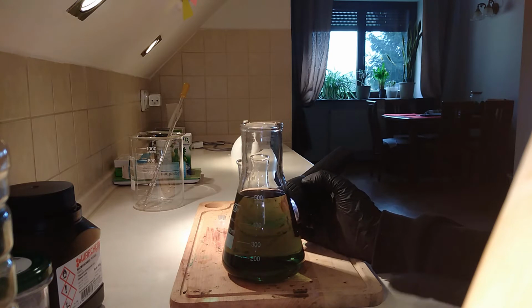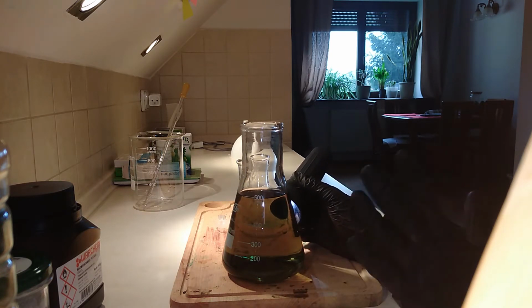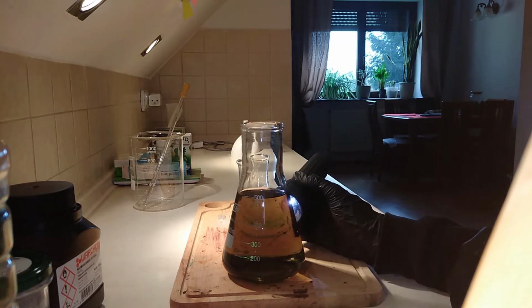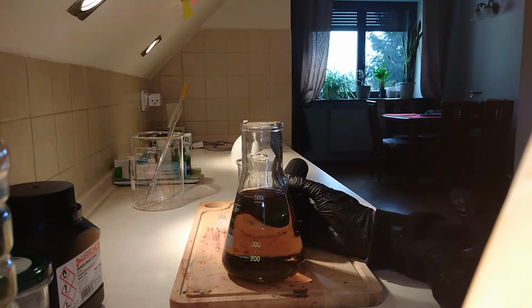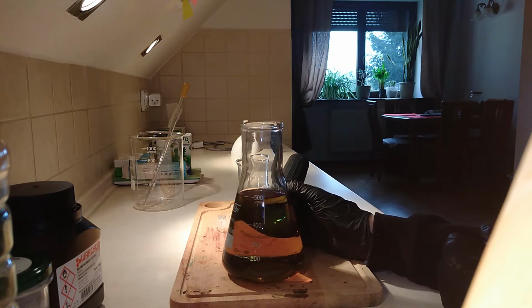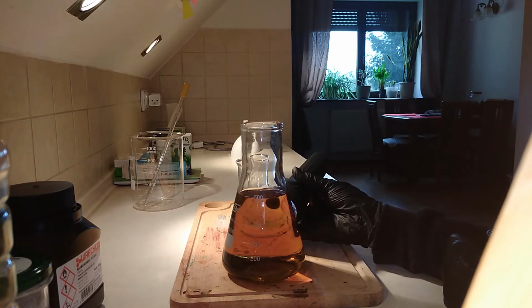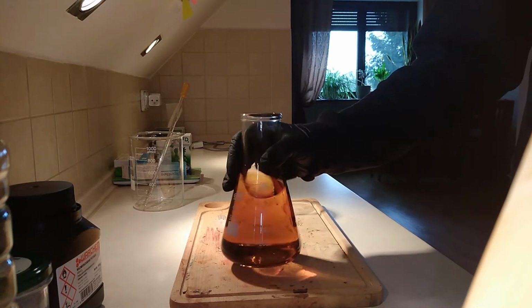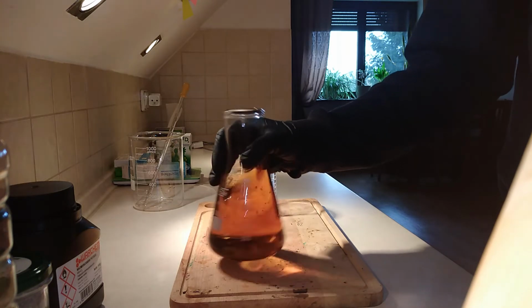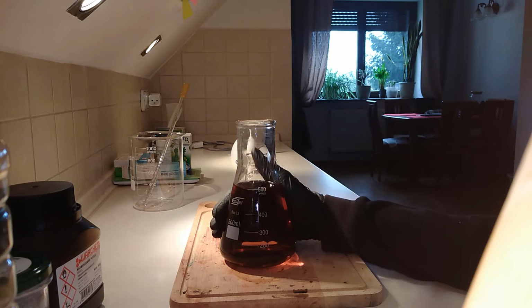It got blue for a moment at first, but this blue is so dark that it's impossible to see. Well, it is possible to see, but it's really hard. So now it gets yellow, and it will get nearly red in a while. As you can see, it gets kind of orangey.